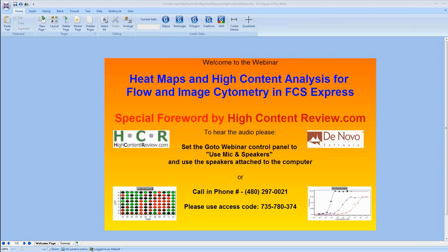And what we can also mention is that if you're working with imaging data, you can also have multiple fields of view for a well. That means if you have 5 images in a well, or if you have 1 image in a well, all that data can be brought in, and when we're using the imaging software, we can go through that and pick all the different images to look at.